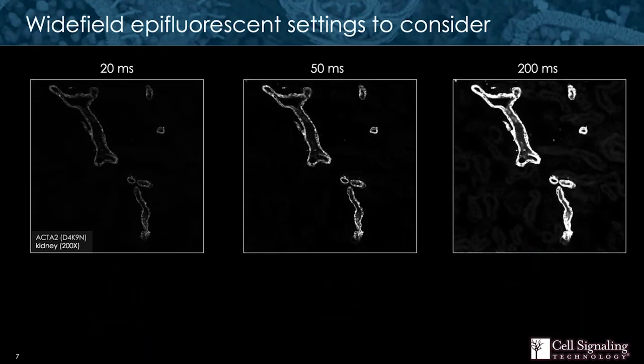When imaging on an epifluorescent microscope, the most powerful tool at your disposal is exposure time. This will determine the number of photons that are allowed to encounter the photodiodes on your camera. Here I'm showing the difference in image quality for smooth muscle actin when you image at 20 milliseconds, 50 milliseconds, and 200 milliseconds.